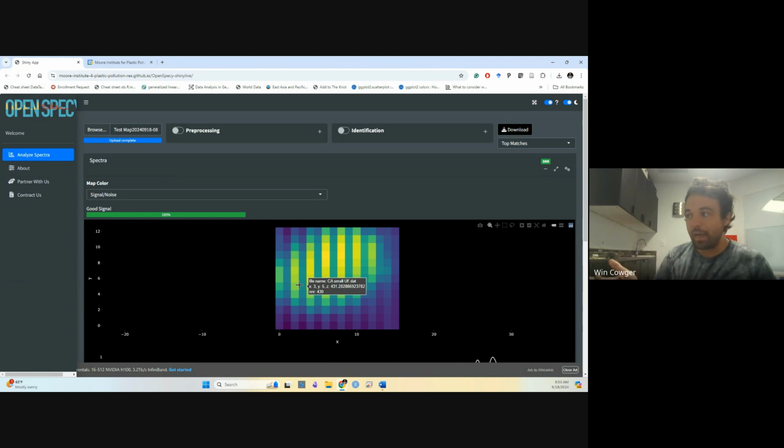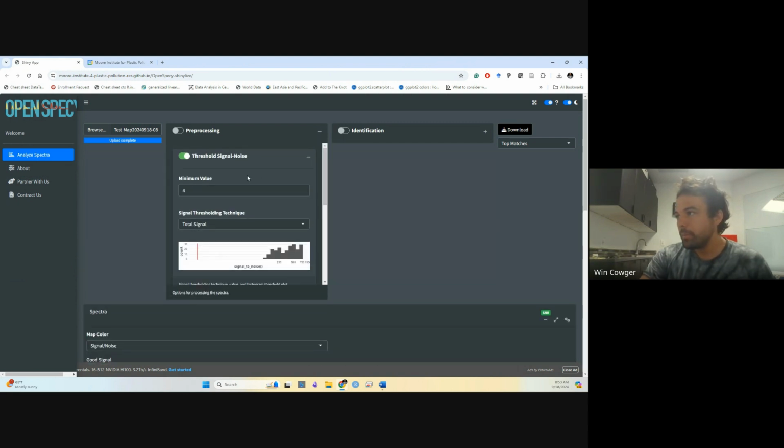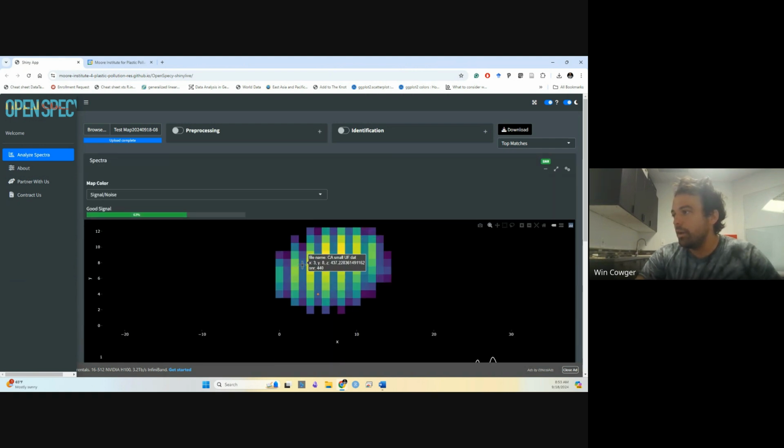Also, sometimes it's more accurate. For example, with this, I think we had decided on 300. So this region here, I can just tell you based off of my experience, I wish I had the visual image for you too, but this particle that we're looking at here is a more accurate representation of where the particle is than the correlation heat map was.